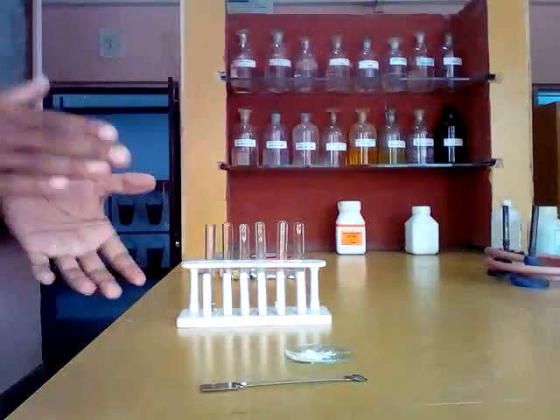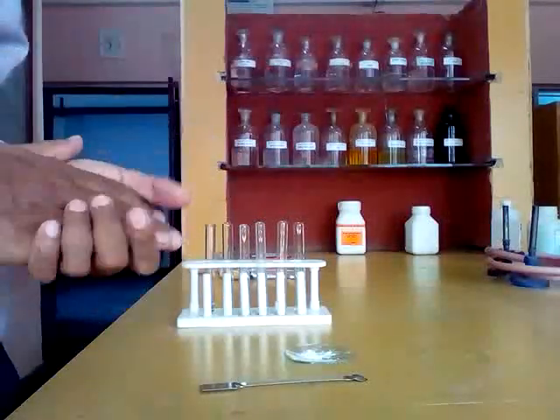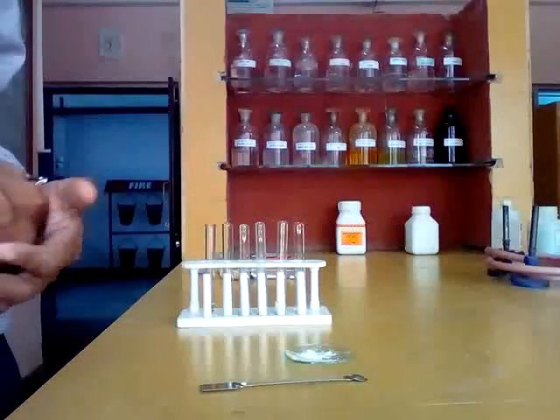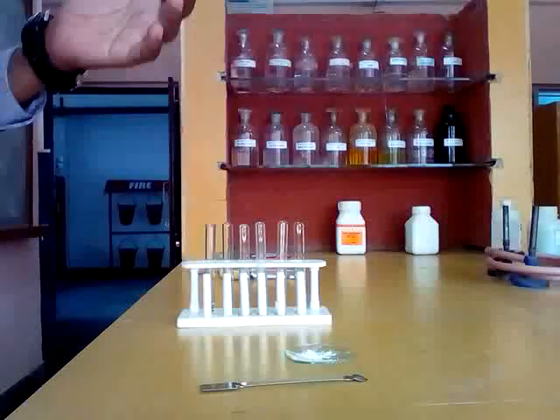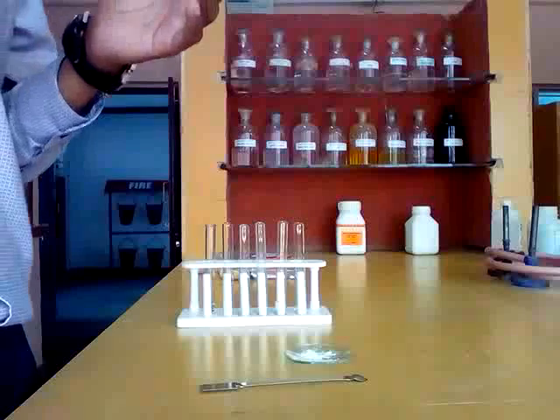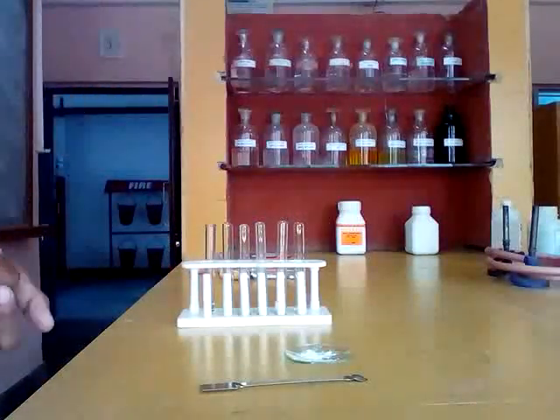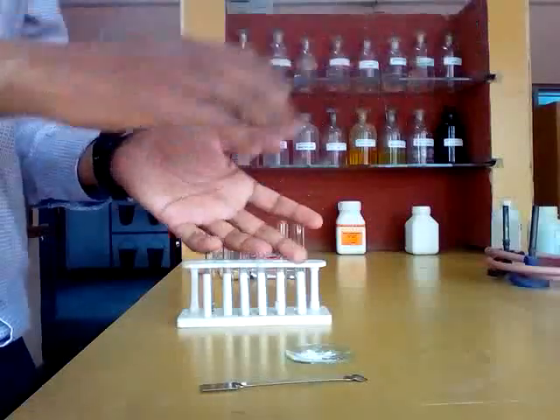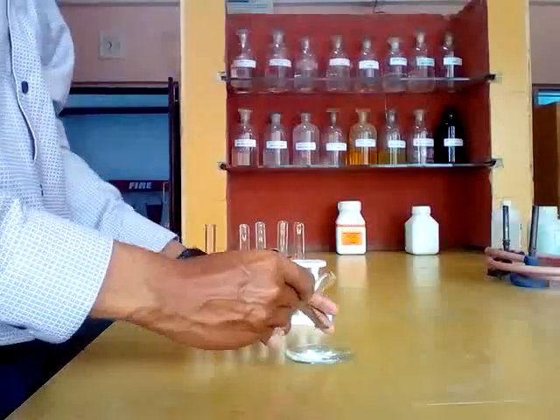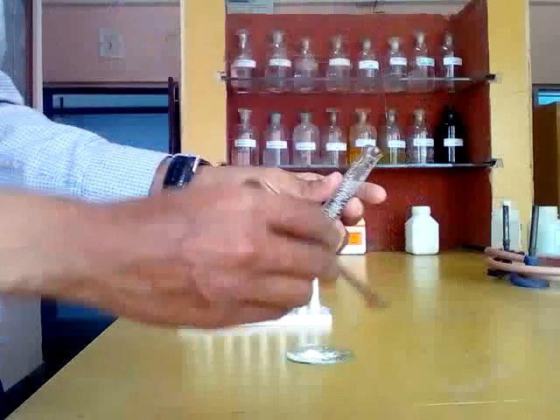Again, the concentrated sulfuric acid test gives observations of four radicals: chloride, bromide, iodide, and nitrate. If chloride is present, then you will get pungent fumes of HCl. If iodide is present, you will get violet fumes. If bromide is present, you will get brown fumes. If nitrate is present, then after strong heating you will get brown fumes. Now we are going to perform the concentrated sulfuric acid test. Take dry salt in a dry test tube.